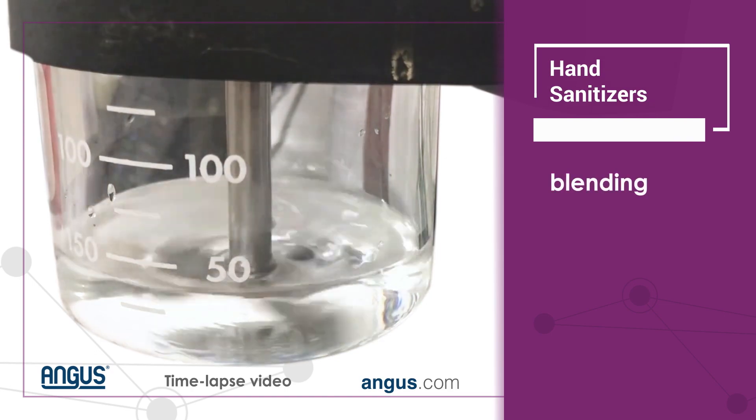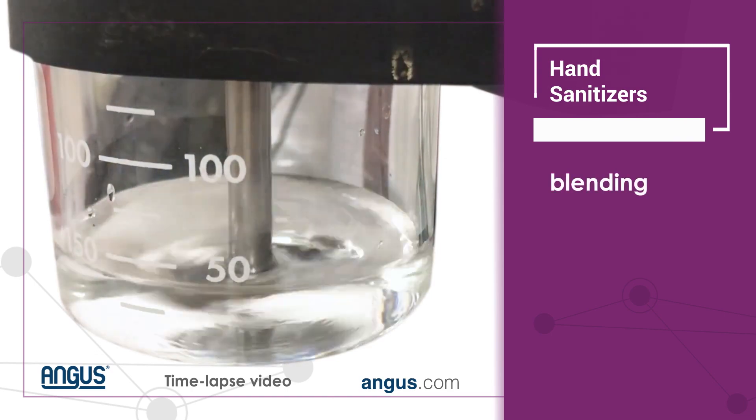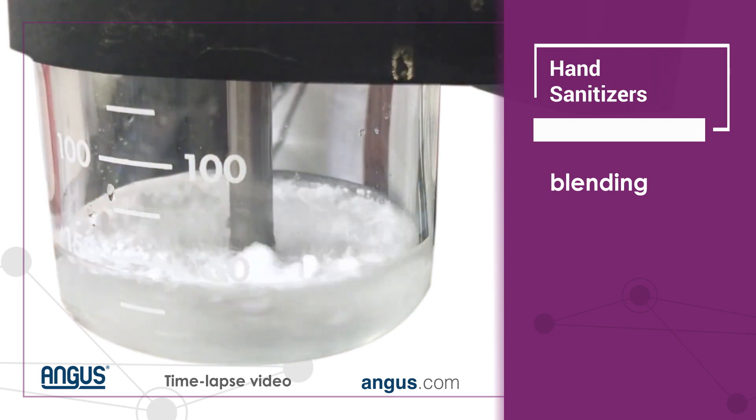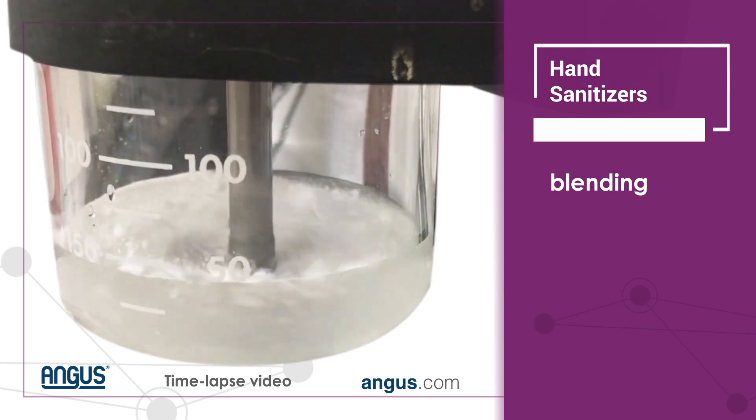To make hand sanitizer, the water is added first, followed by glycerin and carbomer. The carbomer is added slowly and allowed to mix in completely before moving on.